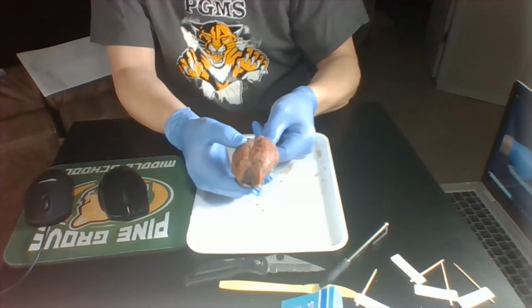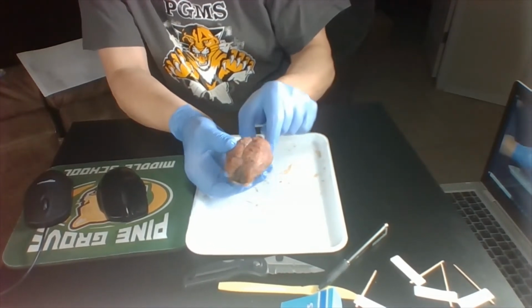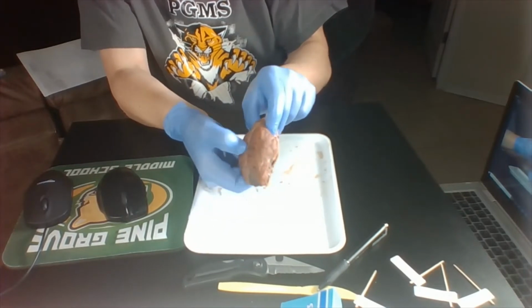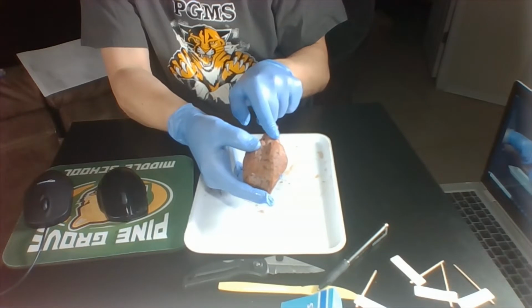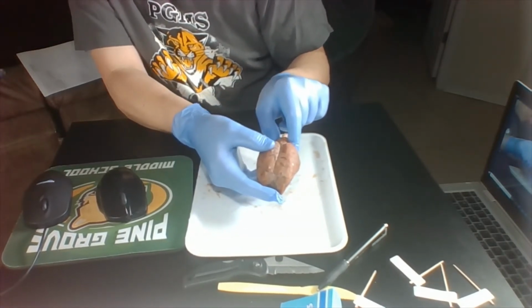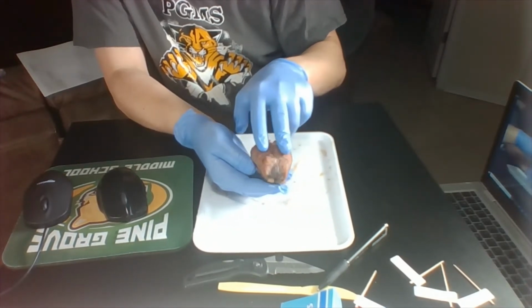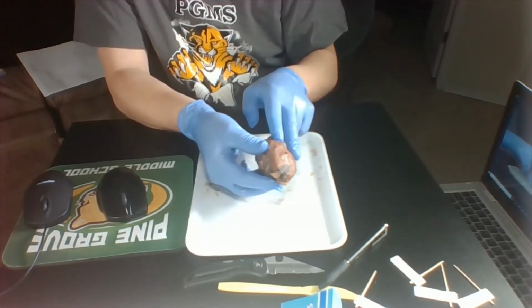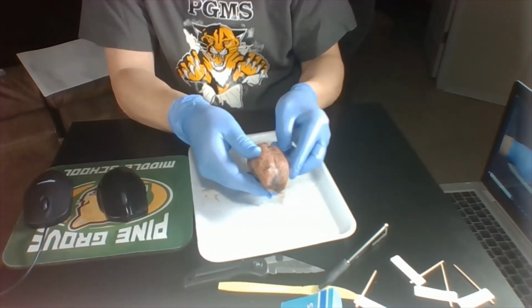So we have the brainstem. The next part is this little part. I'm going to keep moving it because I'm trying to show the different angles on both cameras. And this would be the cerebellum. And then this bigger part up here would be the cerebrum. And it has the two hemispheres. So that's going to be the first thing.